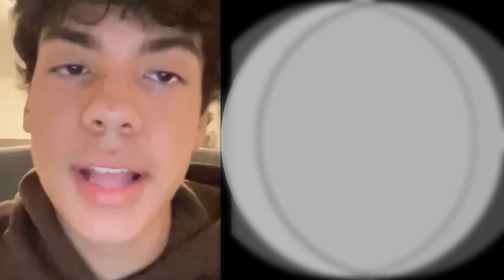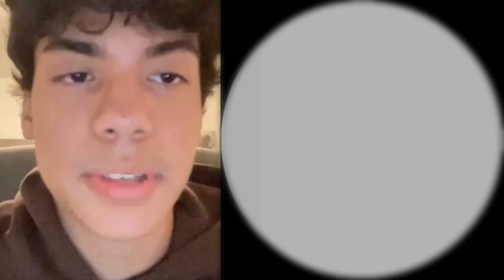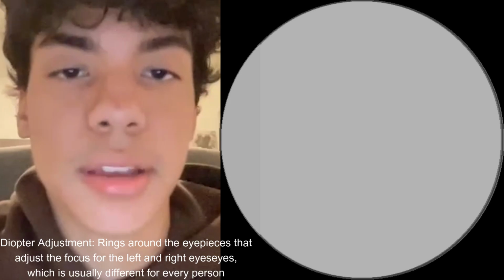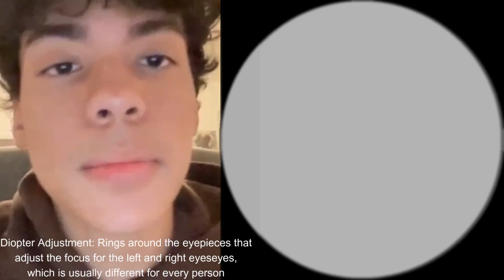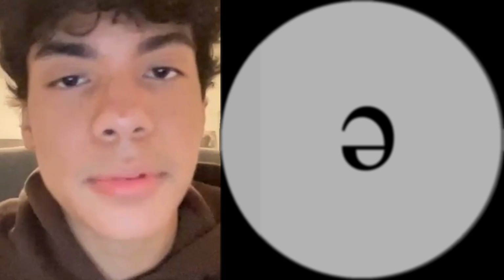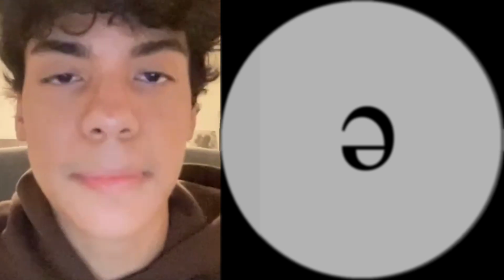First, you want to adjust the eyepieces to accommodate your eye spacing. Then, using the diopter adjustment, sharpen the image for each eye. Next, place the sample using the stage controls. Center the area of the sample you want to focus the lens on.